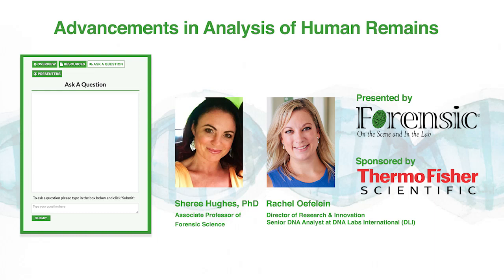Okay, gotcha. So how do you powder the samples with the Dremel without spreading the DNA particles throughout the entire laboratory? This is a question that came in, I believe, for Sheree, and I would feel free to recommend following up with her as well. But we also use Dremels at our laboratory, so I felt like I could probably help out with that a little bit. We use specialized hoods with filtration devices that are vented and have airflow. So you can literally, as you're sanding, see the bone powder lifting up for anything that comes loose, but the rest that we have down at our working areas is collected into weigh boats when we're doing that.